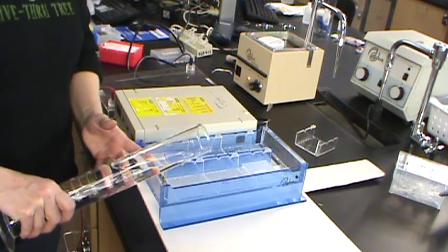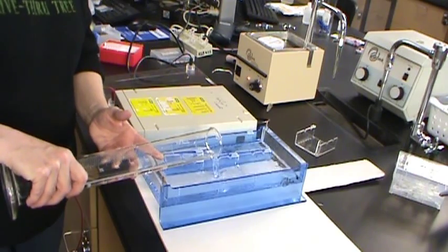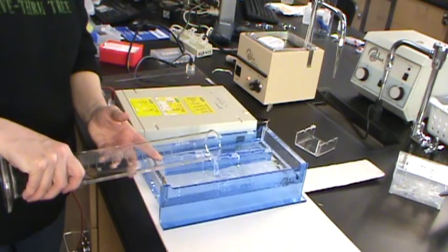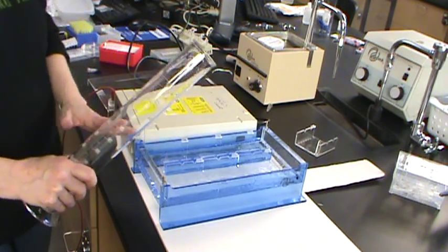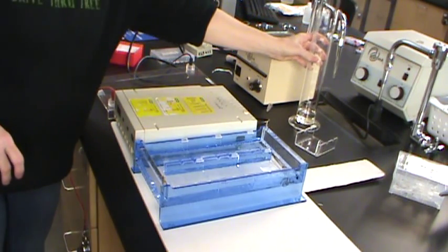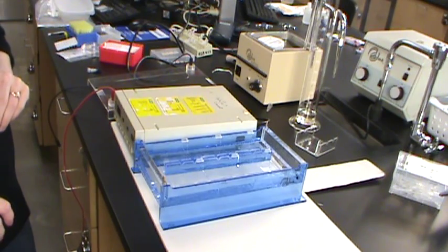And anytime we're going to add samples to our unit, we're going to make sure that we have all of the gels submerged in that buffer. They all have to be wet. The buffer just has to go over the surface of the gels.